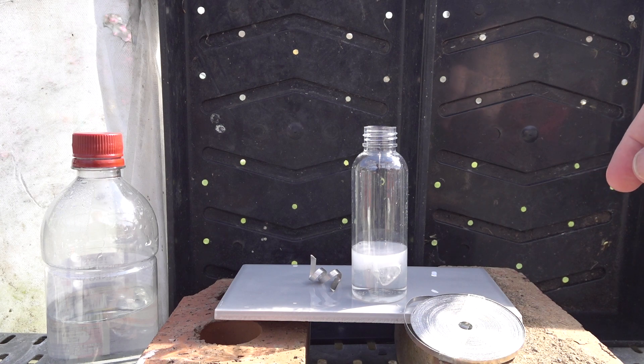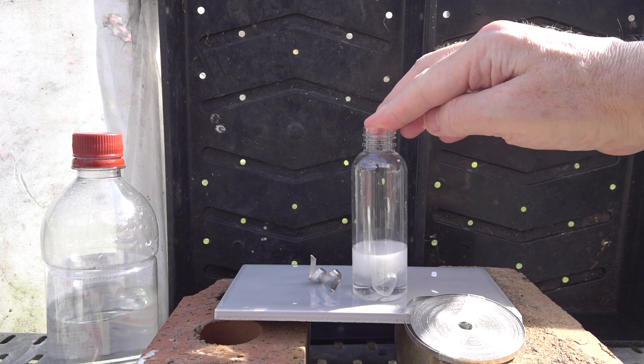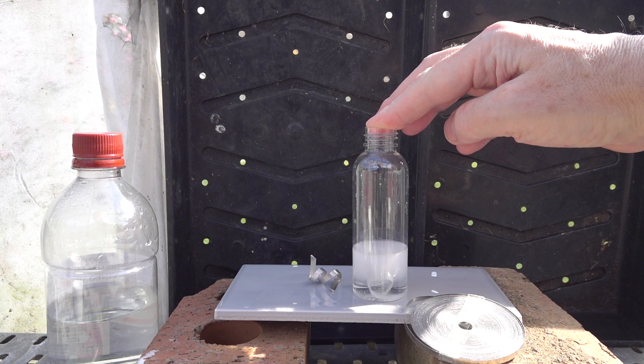It starts to react, bubbling, producing a colorless gas. We can trap the gas with a bung, or temporarily with our finger.